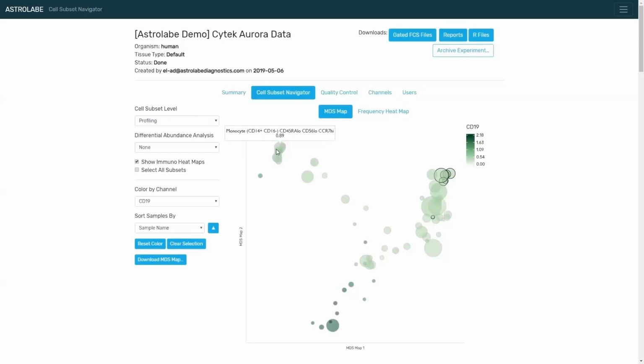So we took the myeloids, and these are all still classical monocytes, but they've been broken down into different clusters. Same for the B cells, same for the central memory T cells. So we see that there's about 8 or 10 different clusters that originate from the central memory T cells.